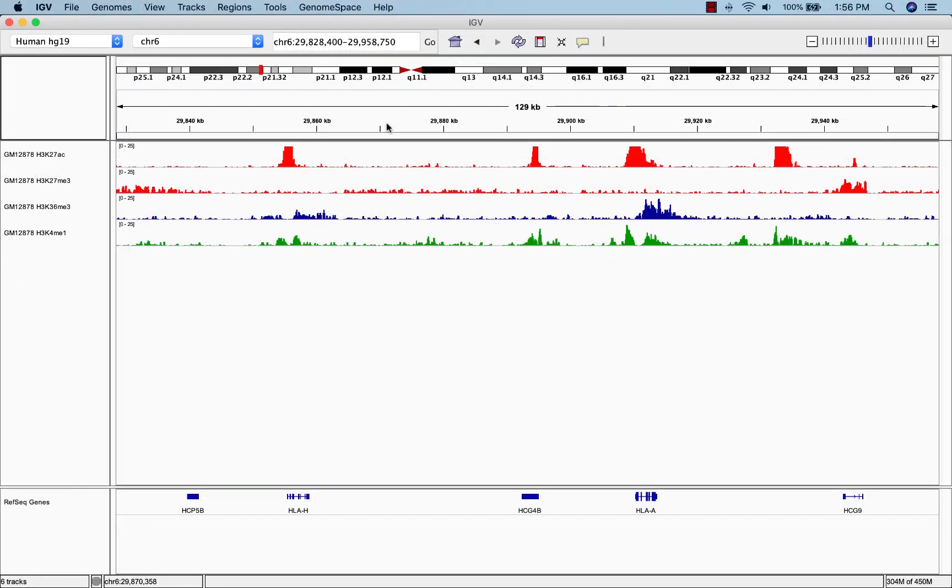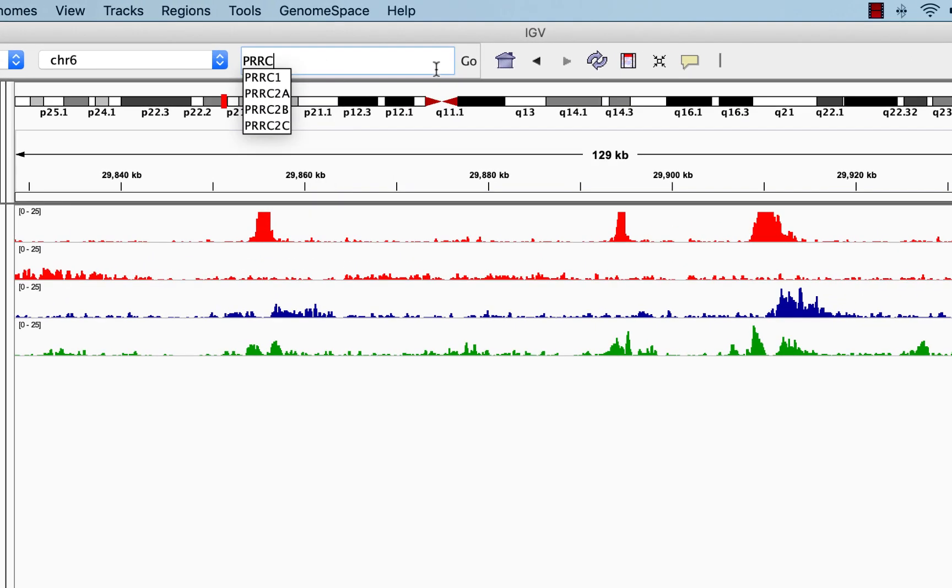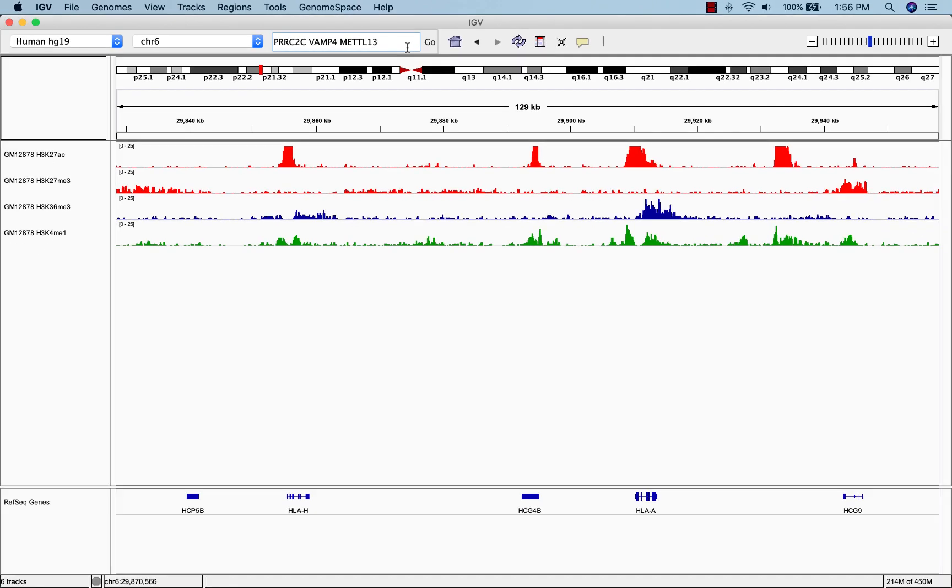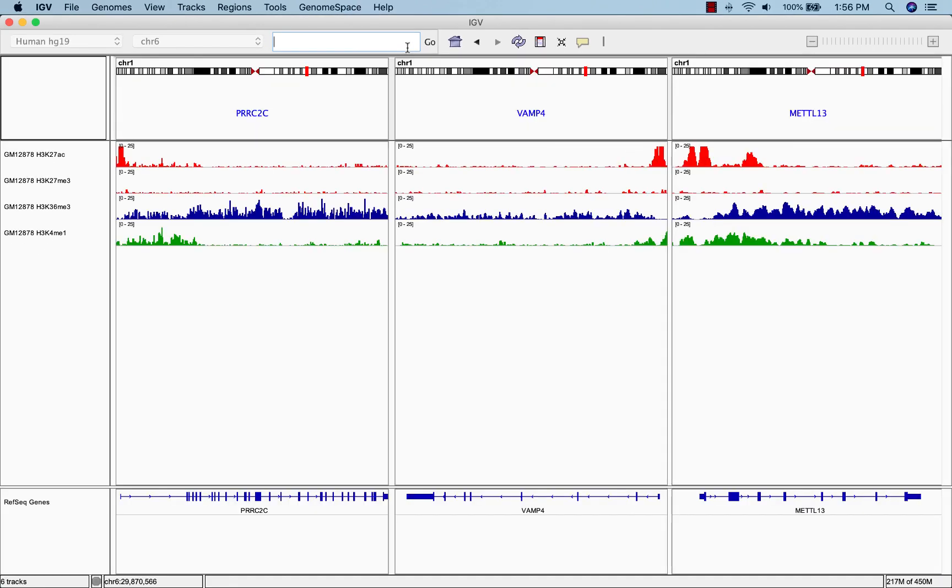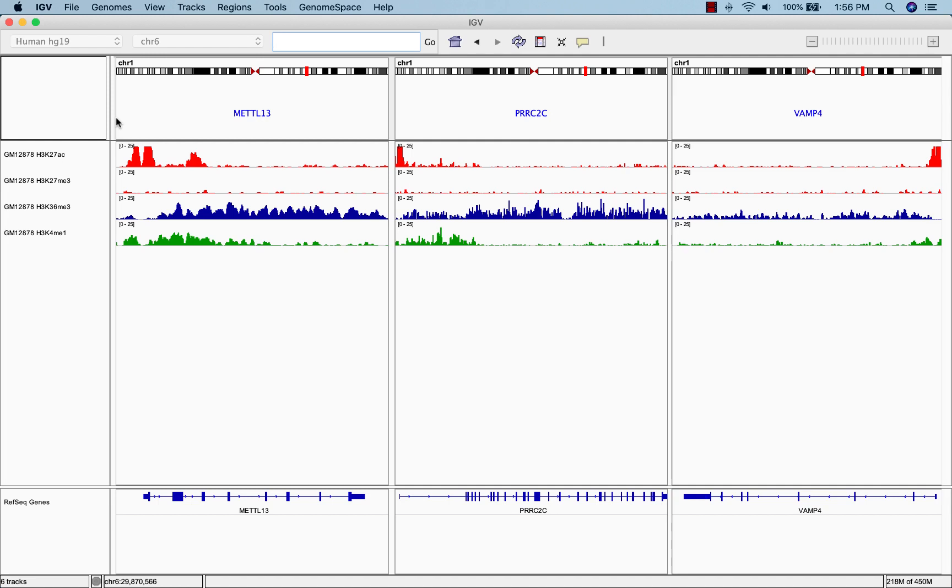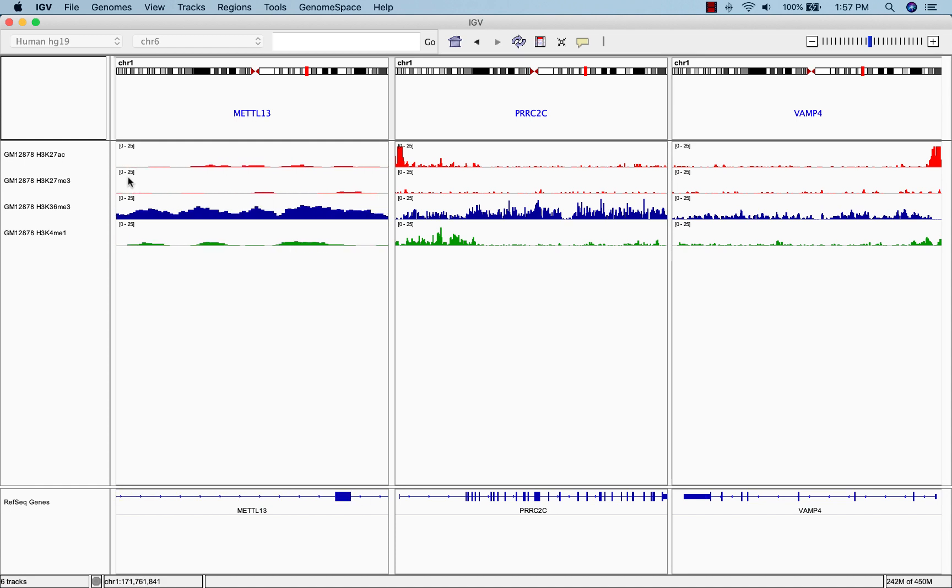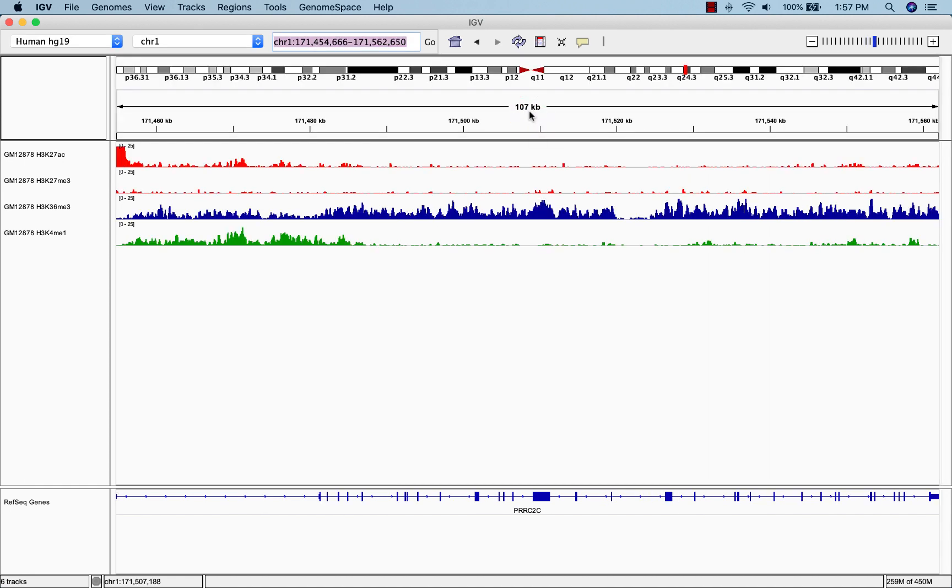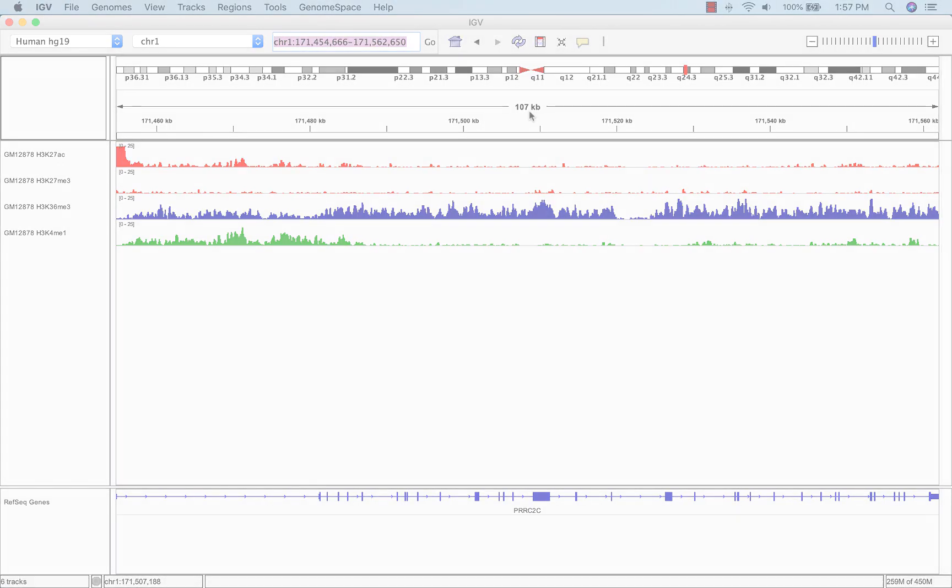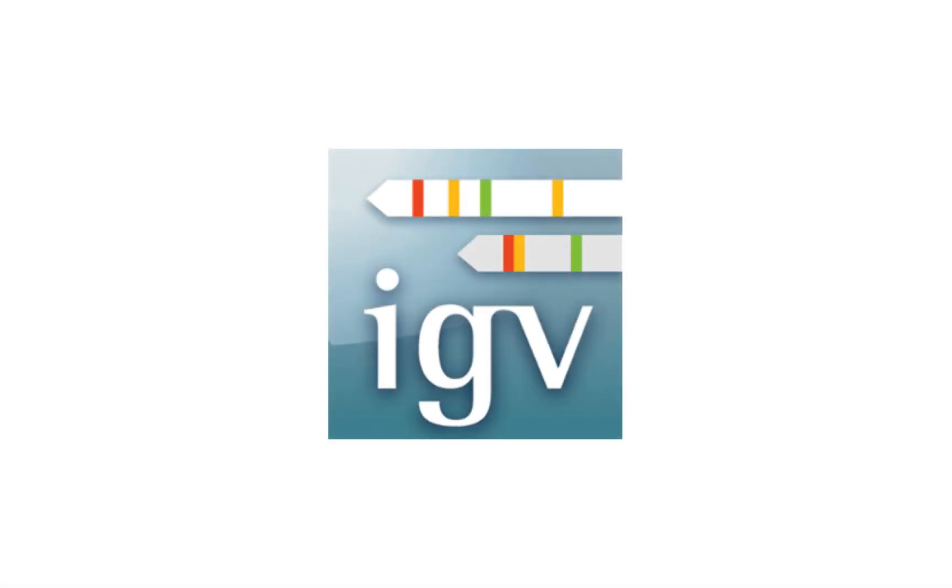If you want to see multiple genes or locations at the same time, simply enter them in the search box separated by a space. Doing this will create separate panels for each feature. You can change the order of the features by clicking and dragging their titles, and you can navigate through them independently. Double clicking any one of the titles will make that feature fill the window.